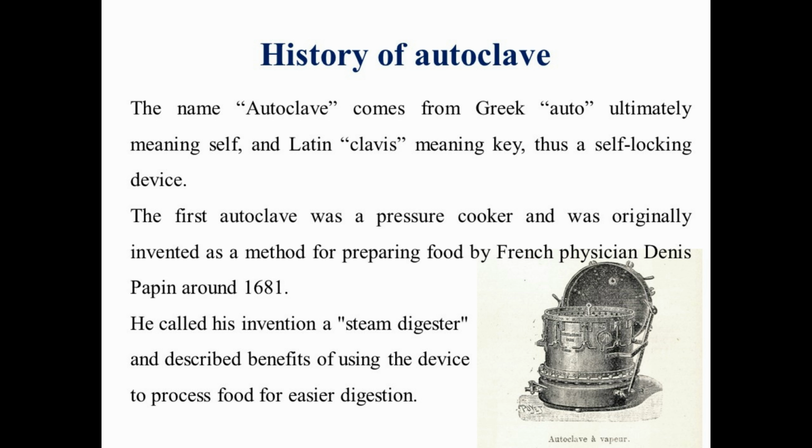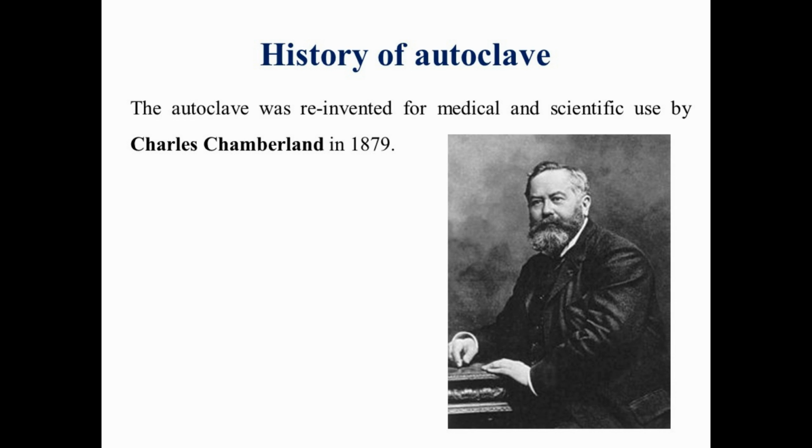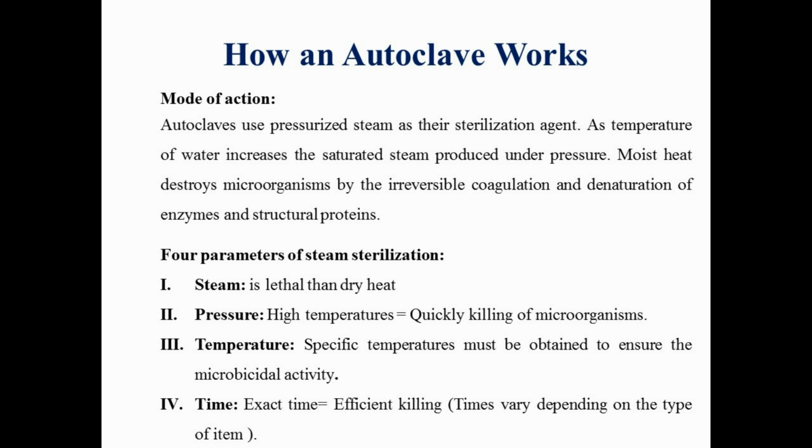History of autoclave. The autoclave was reinvented for medical and scientific use by Charles Chamberland in 1879. Do you know how an autoclave works? As we know, autoclave is used for the sterilization of inanimate articles. The working principle of an autoclave is simple.